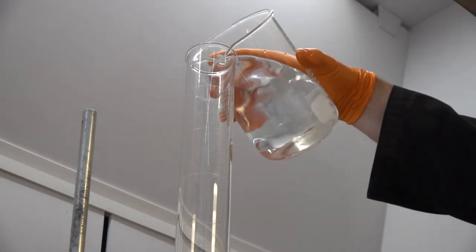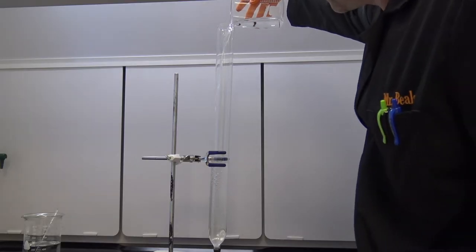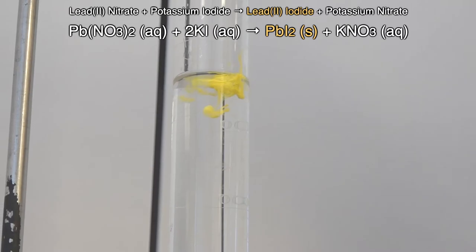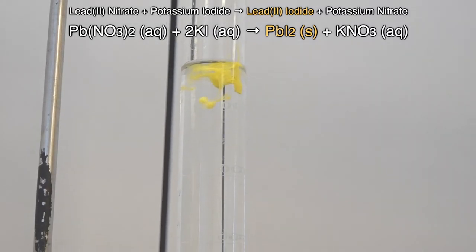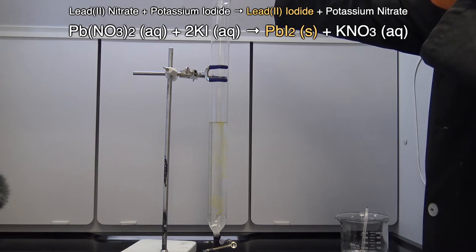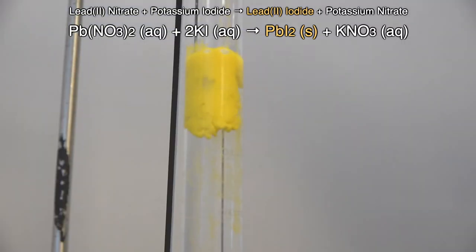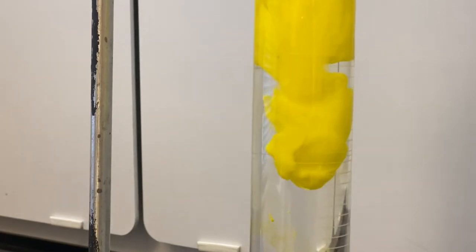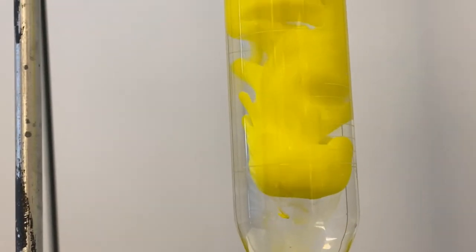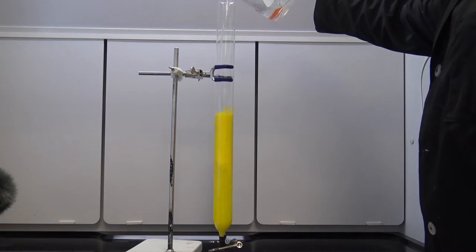We're also gonna use this massive burette. Burettes are usually used in titrations, but I want to be able to see this whole reaction happen. I'm just taking a pipette and dripping some of our lead nitrate into the potassium iodide. We can see this solid forming — the precipitate is forming — and look, it's moving down to the bottom. It's more dense than the liquids around it and eventually it's gonna fill up this whole space.